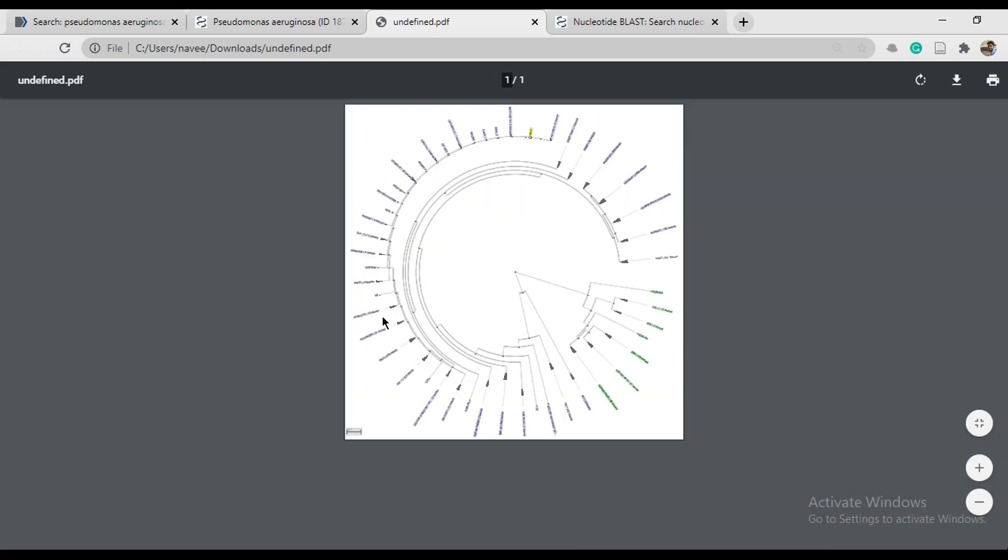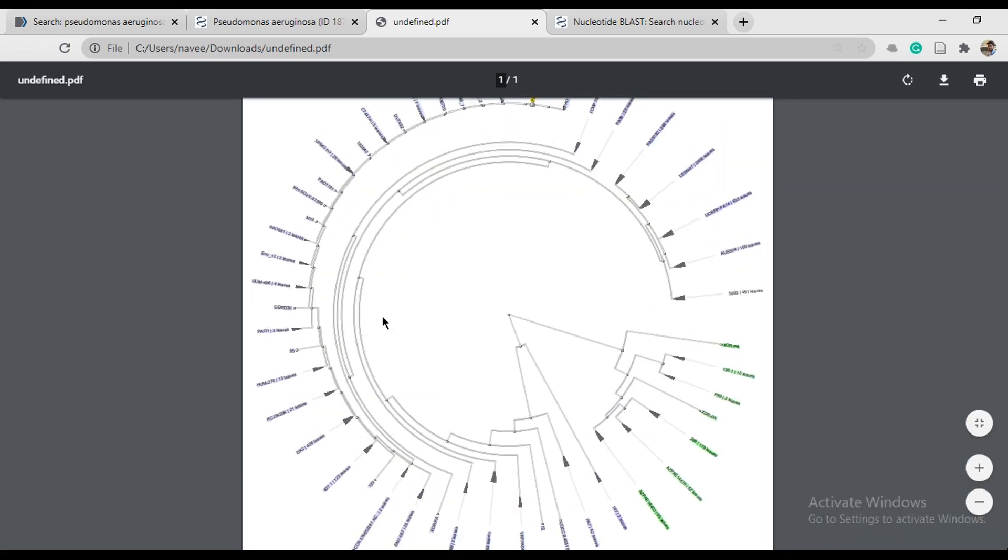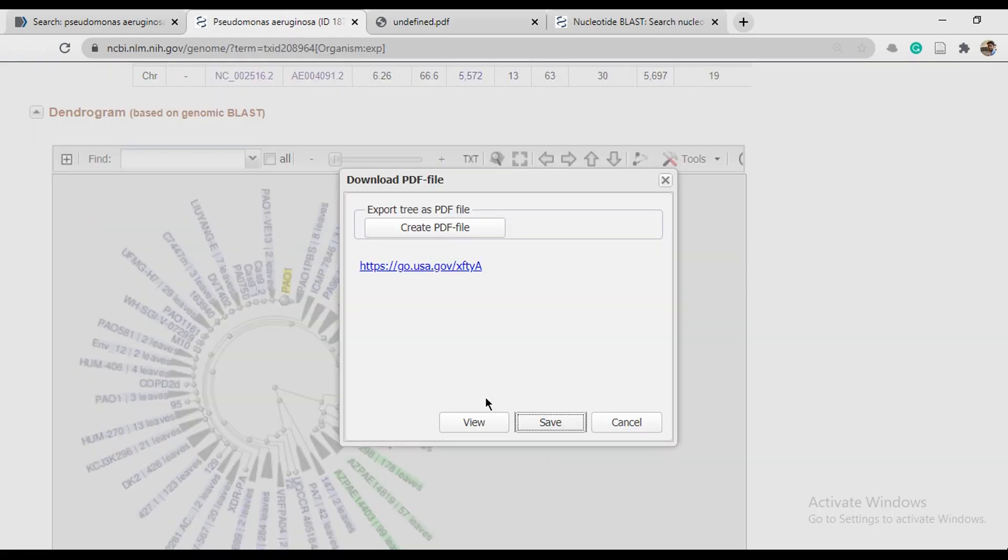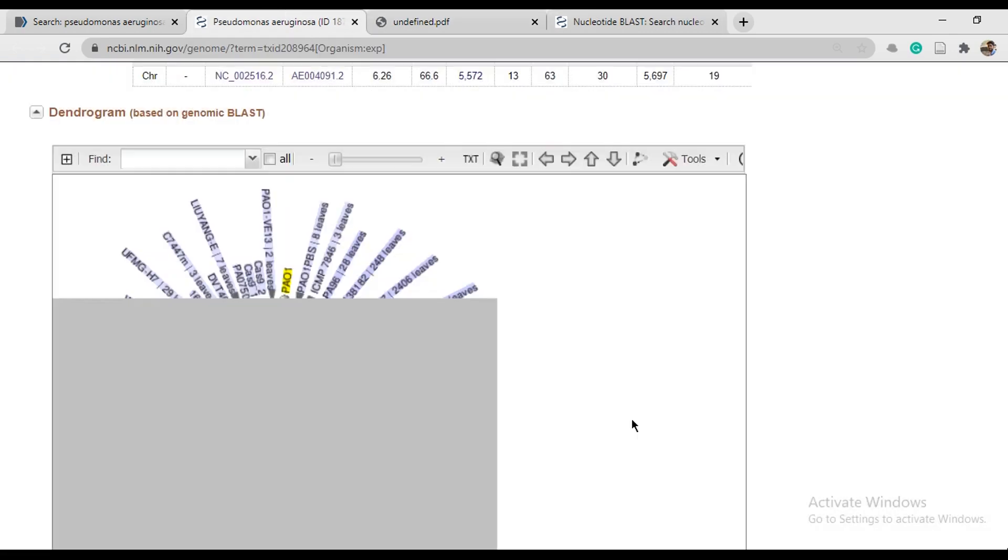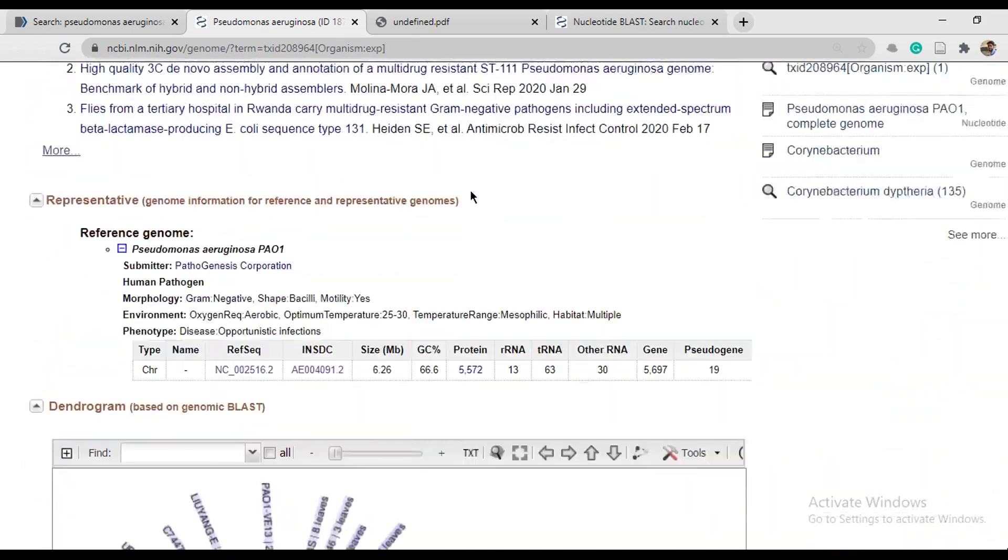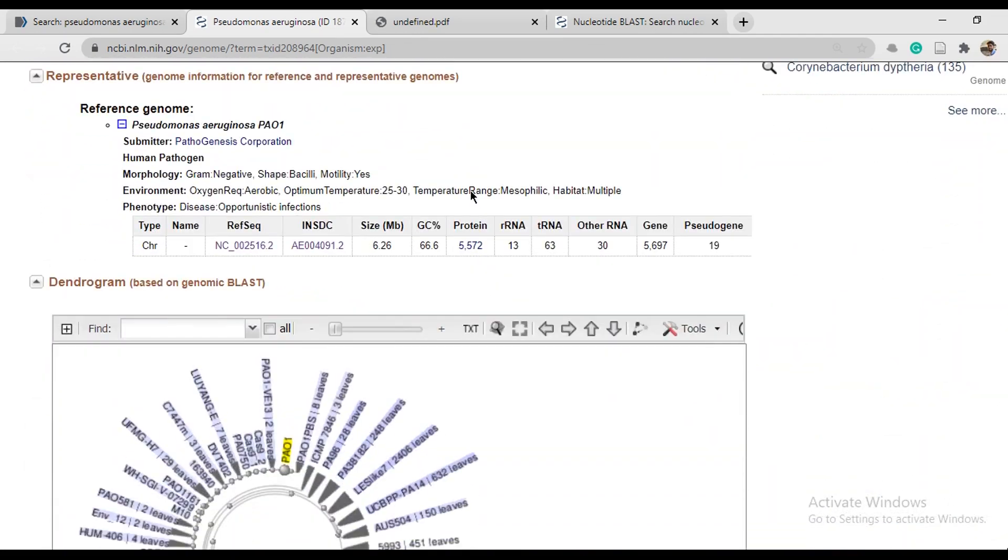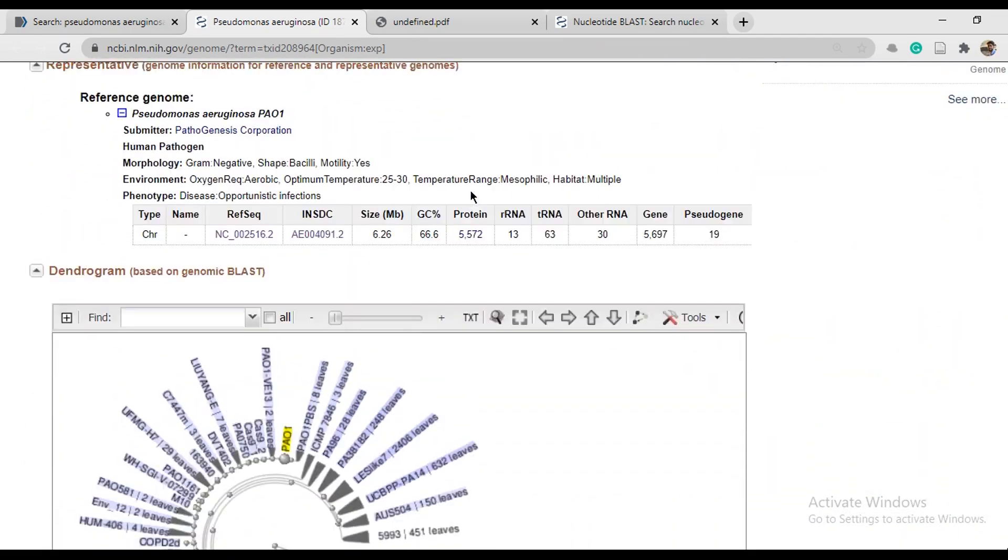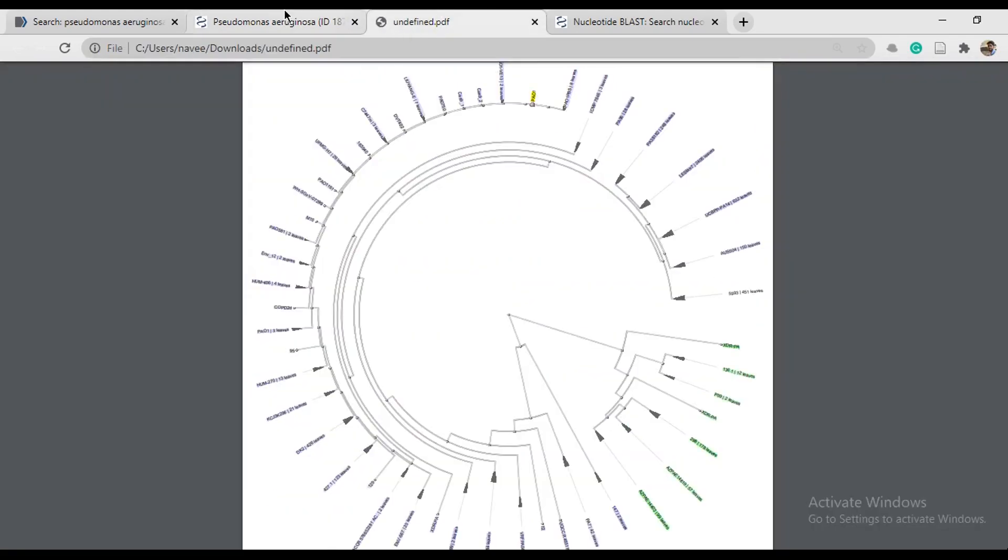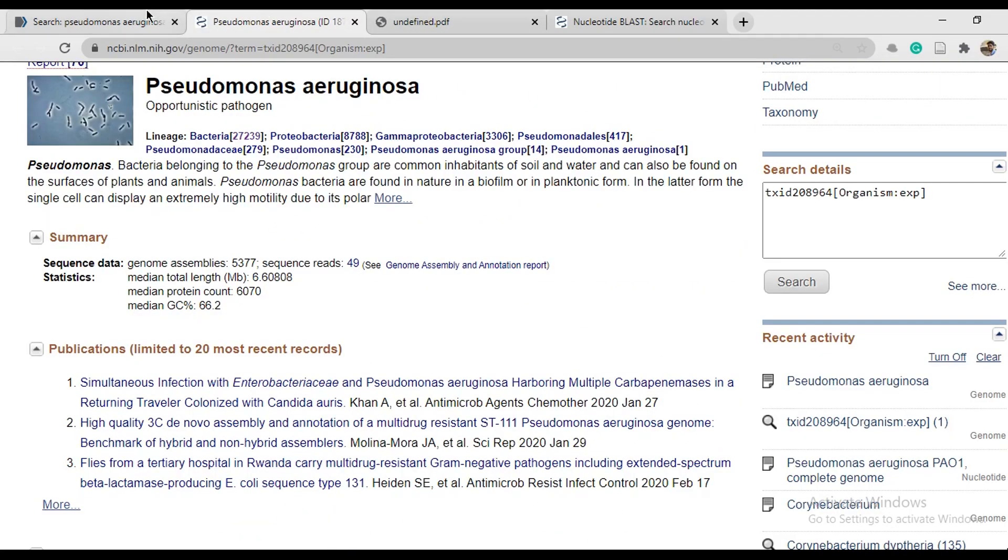So this is your total genome. You have dendrogram of bacteria. It's not a FASTA sequence. We need a FASTA sequence to continue.